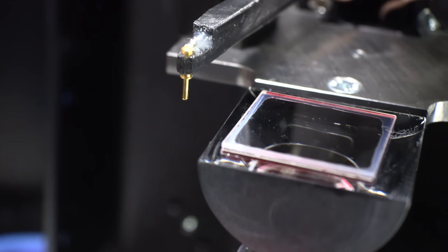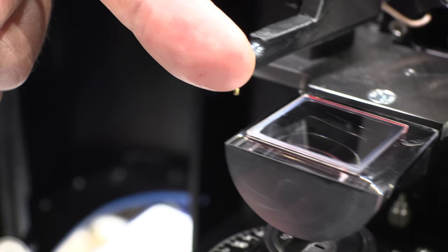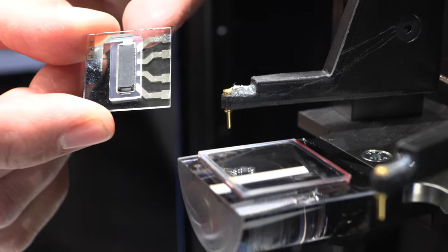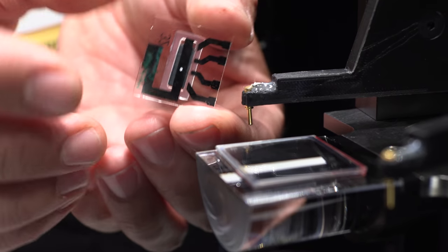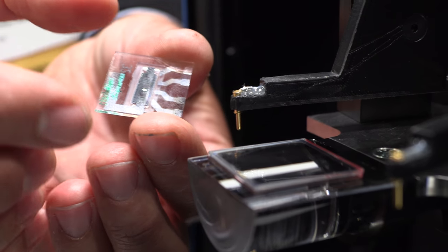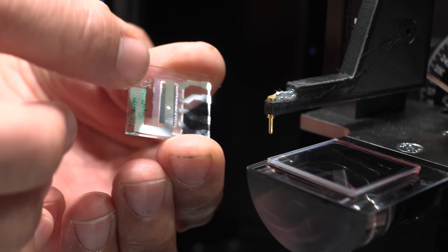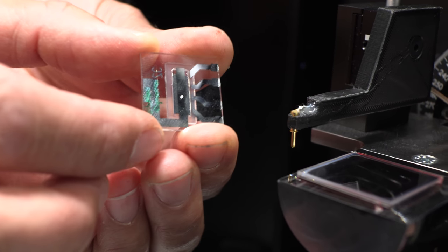Yes this is a large area film. This film that looks transparent will then be used in an OLED. This is now a research OLED pixel. There are a few OLEDs here inside, just four of them. It's not a high resolution display.